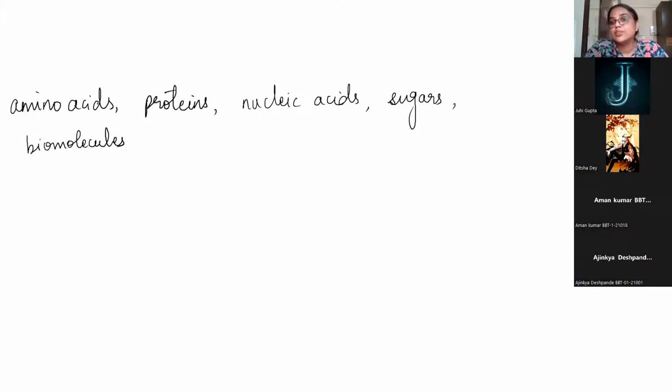You know, amino acids will contain nitrogen, N, as one of the amino groups. You will see sugars are carbohydrates. So see, the chemistry is different, the structure is different. So when the light falls on those particular molecules, light will also behave differently, okay, and that is going to help us to analyze what is there in your compound.